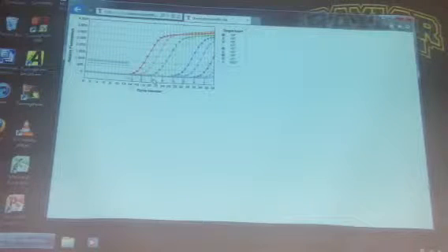But if you look at the differences here, we have liftoff at cycle 24. Here we have liftoff at cycle 27. So in other words, we don't see anything, but by the time we get to cycle 24, we begin to see a band showing up. And here, with this amount, we begin to see a band showing up around cycle 27. So it's only 3 cycles difference.